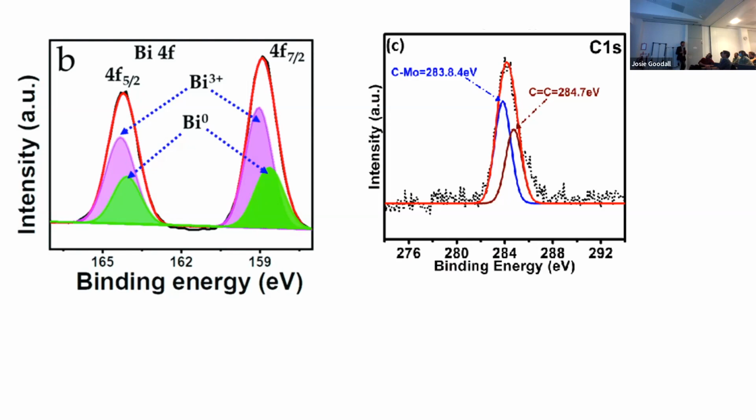I think the CasaXPS software implements lots of these kinds of patterns. So it's quite easy to do that, especially now, if you're more interested in that. It's very, very easy to do.